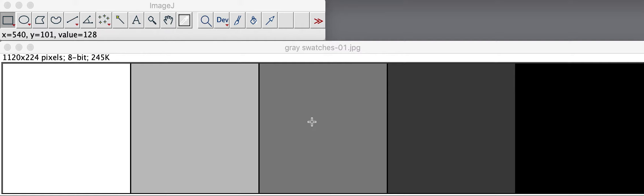Let's take a look at how to use the ImageJ program to measure image density, and this can be used as sort of a rough equivalent of using a spectrophotometer if you have photographs of different samples.